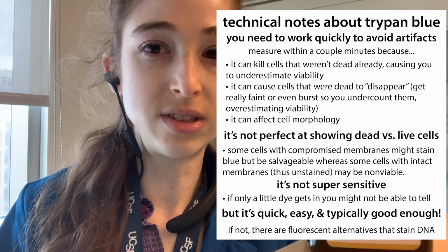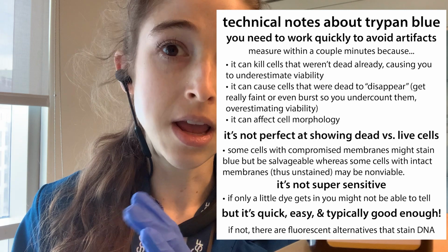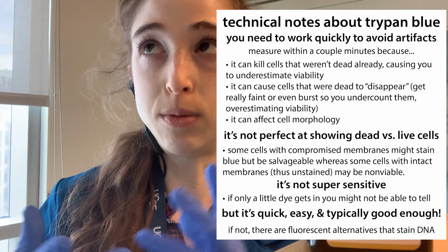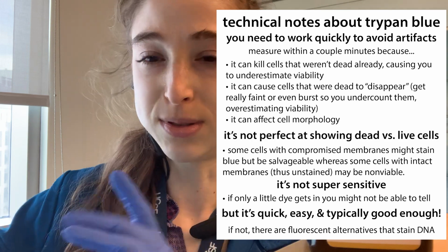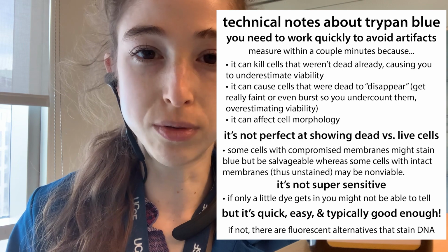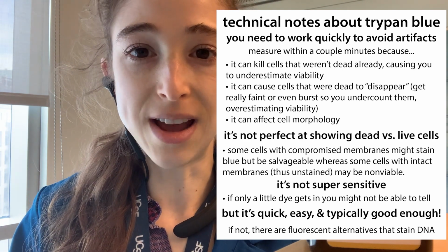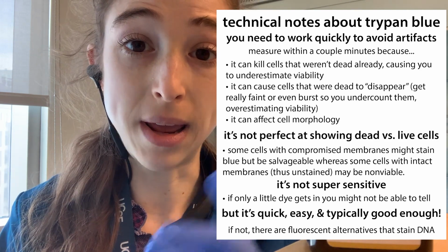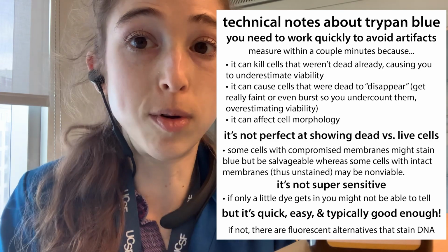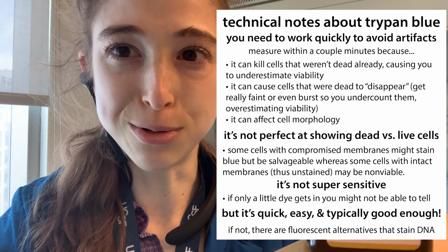Some alternatives. Typically, there are other alternatives like fluorescence that are more commonly used for determining viability when people are doing FACS or various cell sorting based things. But in the lab, in the tissue culture room, when you're just trying to see how the cells are doing, trying to count them, Trypan blue is very, very commonly used. It's quick, easy, just needs a normal microscope, and so here's how it works. Also the trypanosome stuff, because it's really cool.